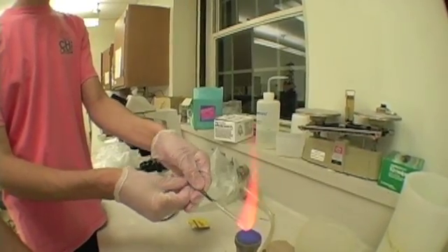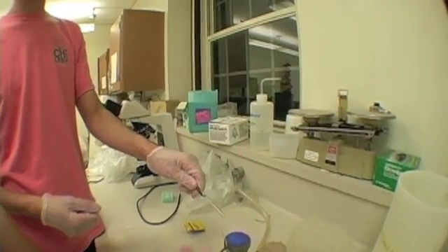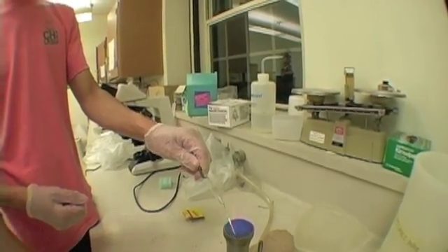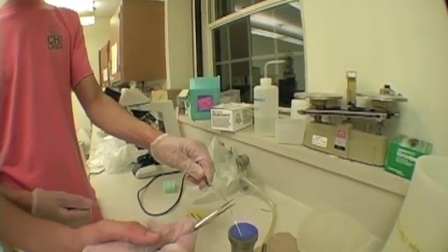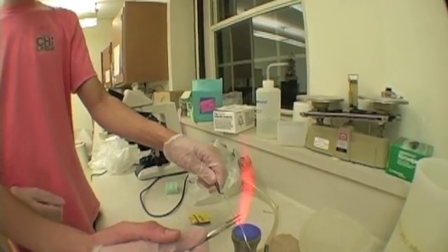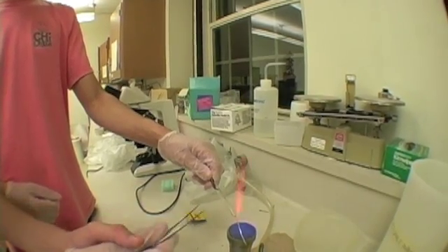Continue heating the glass rod until the hole begins to close. Then get your lab partner to grab onto the platinum wire with tweezers and place it into the closing hole. Then continue heating to close the hole in the glass rod. Get your lab partner to slowly pinch the glass over the fire — the glass should fold on itself, bonding the platinum wire to the glass rod.